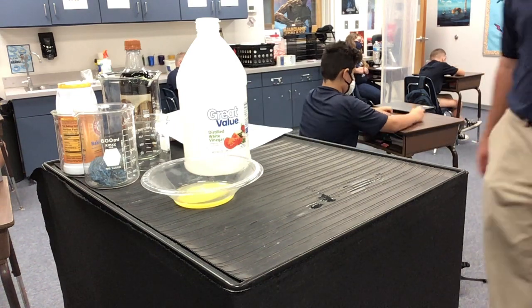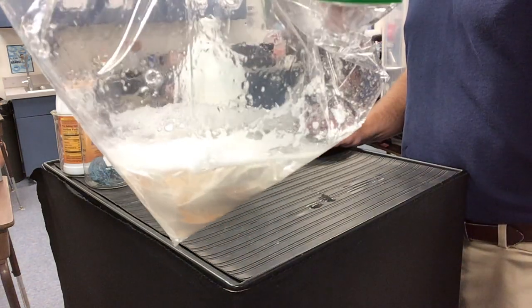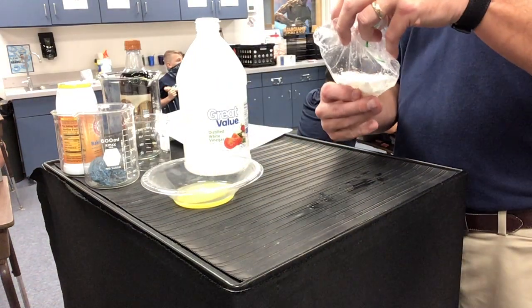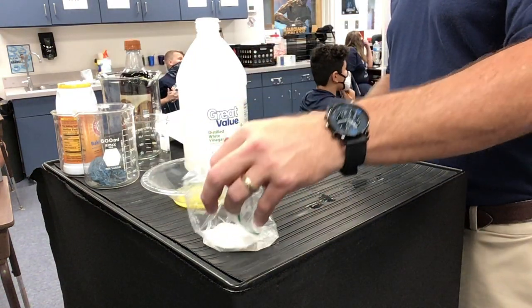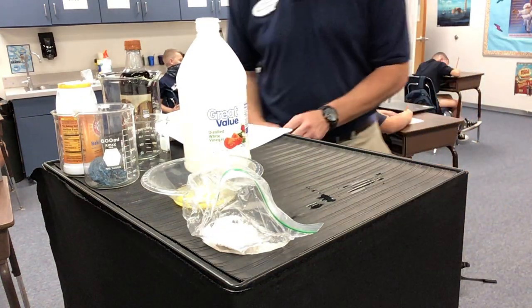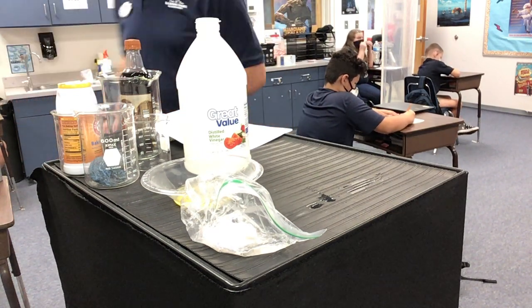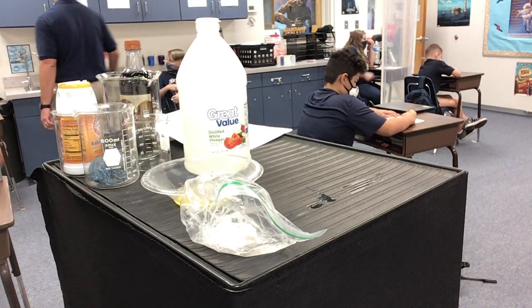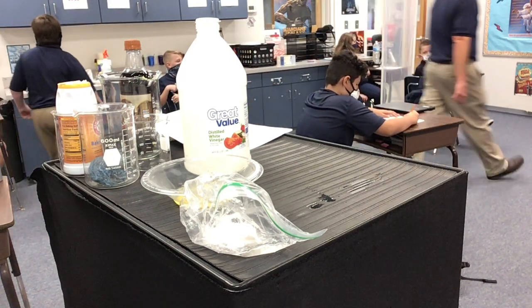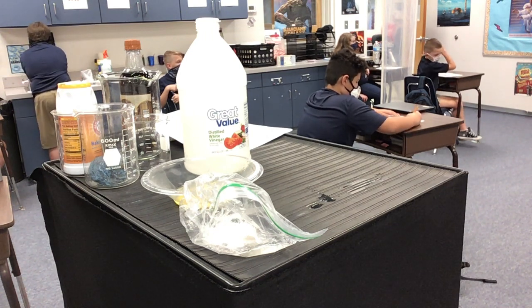Okay, again, for our friends online, here you go, take a look at it. What do you kind of see? We're going to let that sit there for a little while and just go from there and see what happens after that. So we'll come back to that one, okay? The next one.